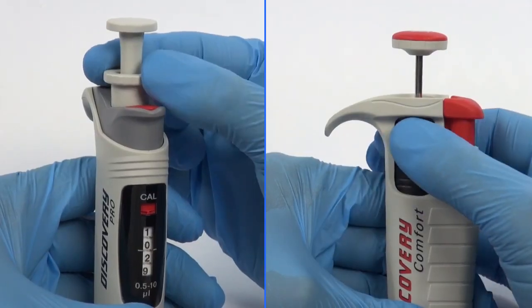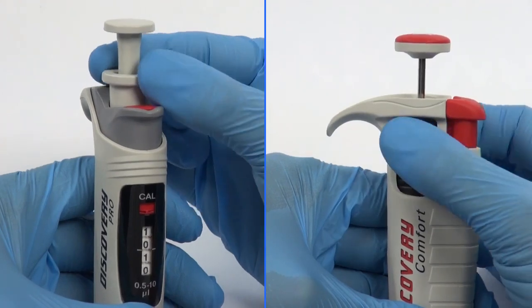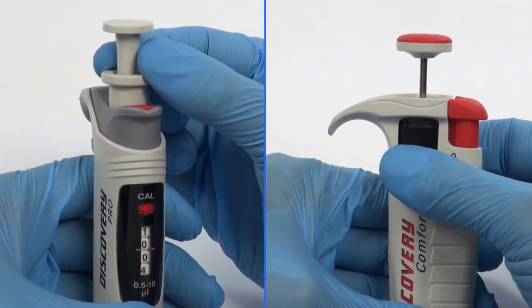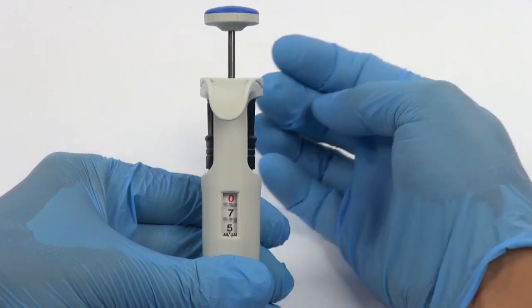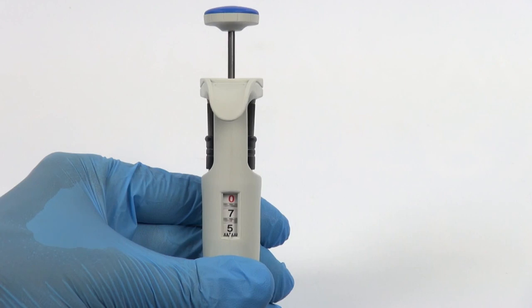Additionally, Discovery Comfort and Discovery Pro pipettes are equipped with a volume lock mechanism. The volume shown on the counter is represented by 3 or 4 digits, which should be read from top to bottom.